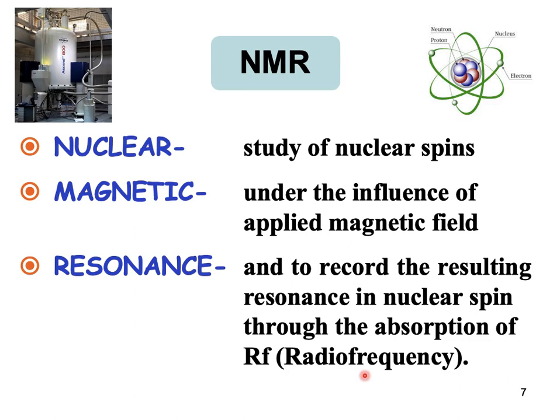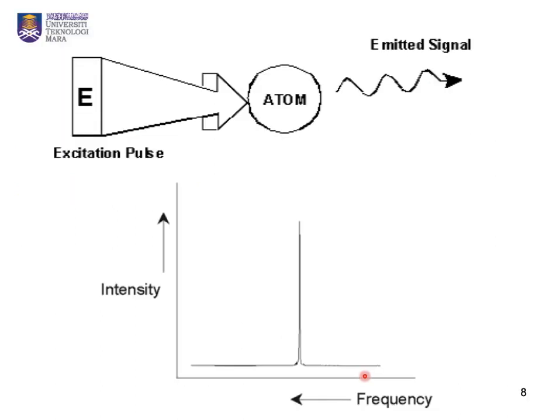In practice, proton NMR, which is hydrogen NMR, which we will discuss later, and carbon 13 NMR, which detects carbon in a molecule, are the techniques most often used by organic chemists, because hydrogen and carbon are the primary constituents of organic compounds.